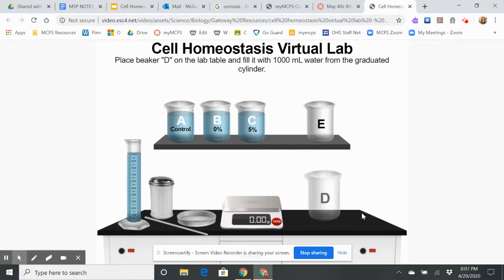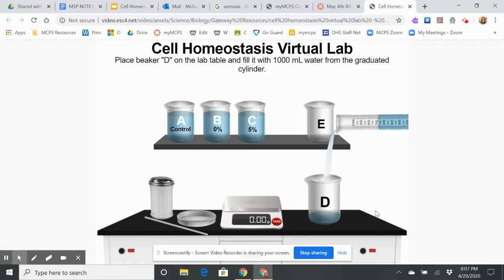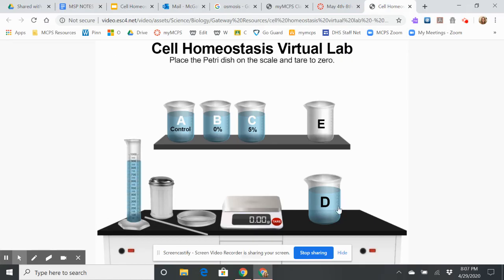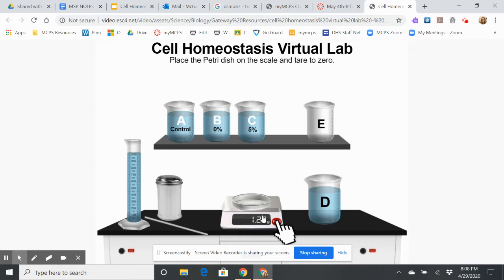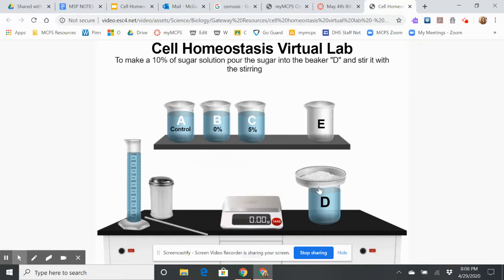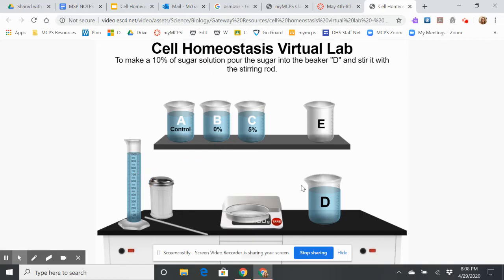Now I've got beaker D, and I'm going to add 1,000 milliliters of water. Now I'm going to weigh out more sugar — I need to zero the balance first. I'm going to add 100 grams of sugar, pour it into the water, and then stir it. So now I've created a 10% solution.